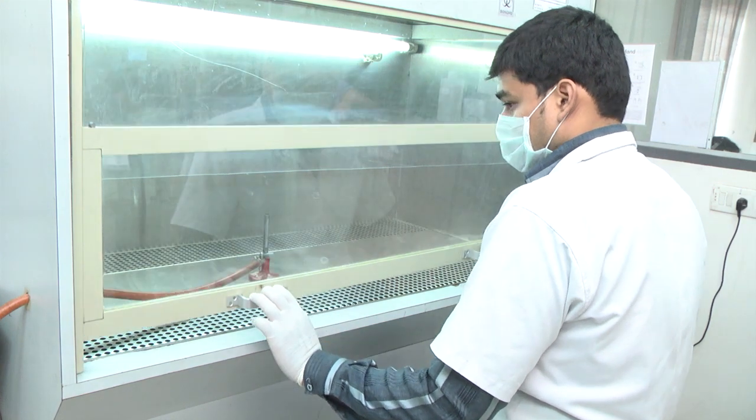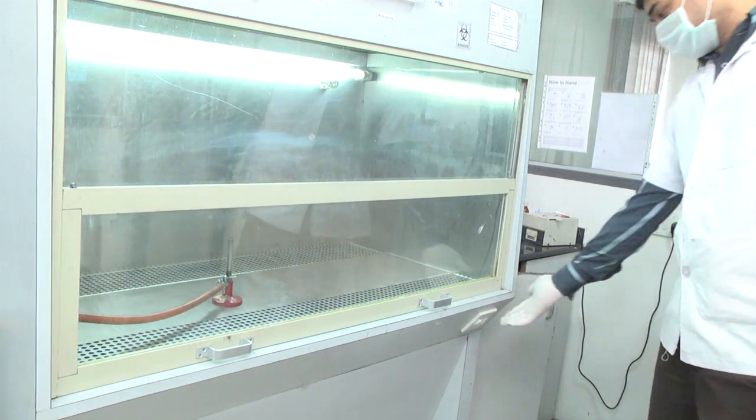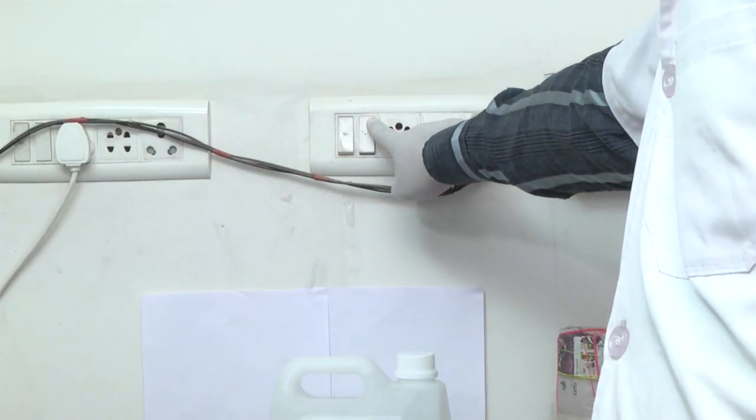Check everything is set right and close the hood. Switch on the UV light for 30 minutes, then switch off the UV light and the machine finally.